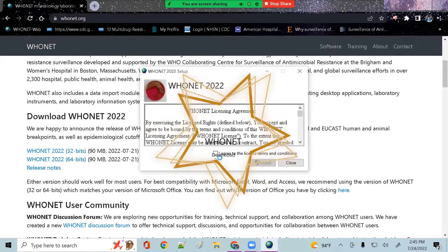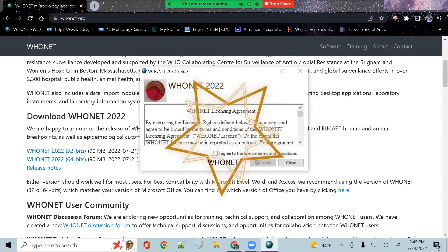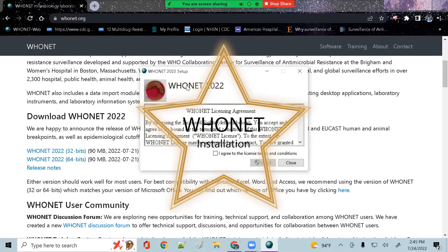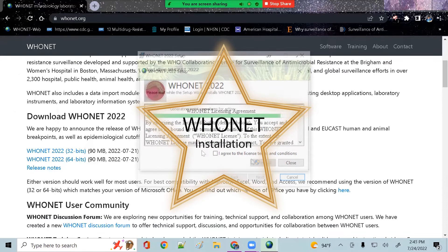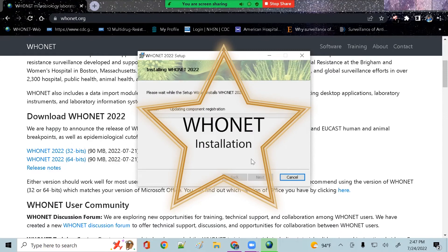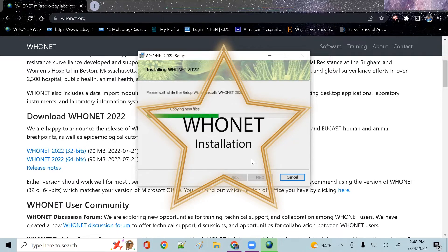WhoNet also includes a data import software called Backlink for the capture and standardization of data from existing desktop applications, laboratory instruments, and laboratory information systems, to avoid the need for double entry of data.